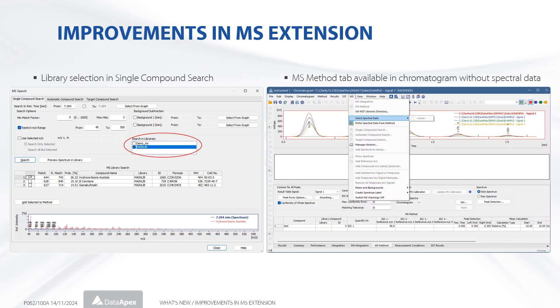In Clarity 10.0, several improvements for the MS extension have been made. Users can now select multiple libraries for search also on the single compound search tab. The MS method tab is available for evaluation also in chromatograms without spectral data, such as those with only a standard signal from a non-MS detector.